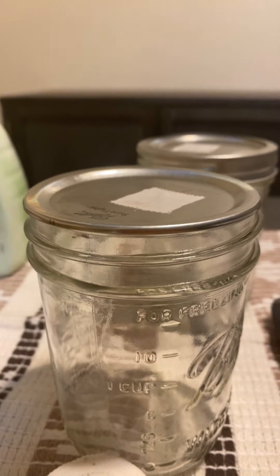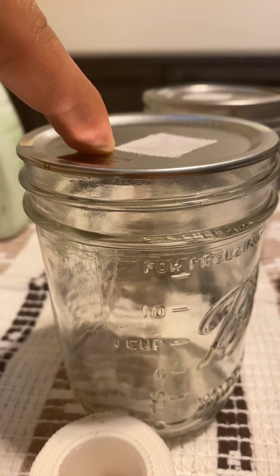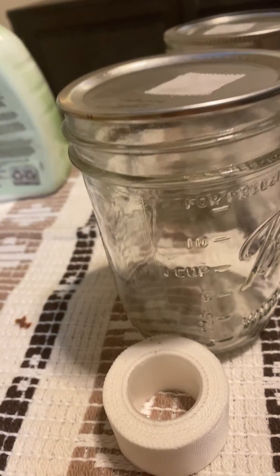The whole idea is we're using these smaller pint jars, and we're just going to do a bunch of grain-to-grain transfers into larger jars when this jar is done colonizing.